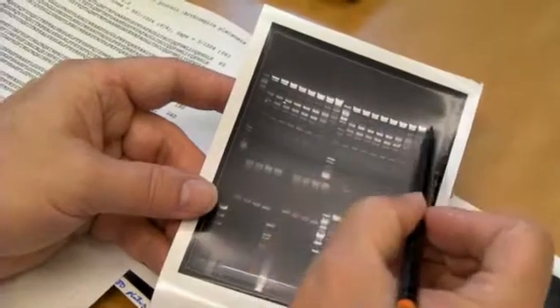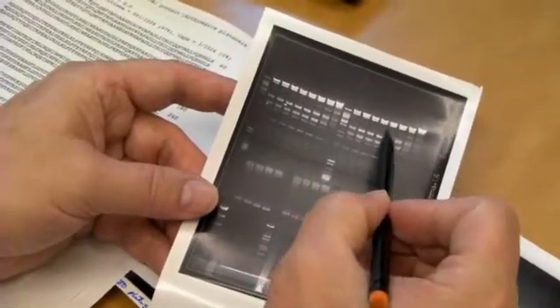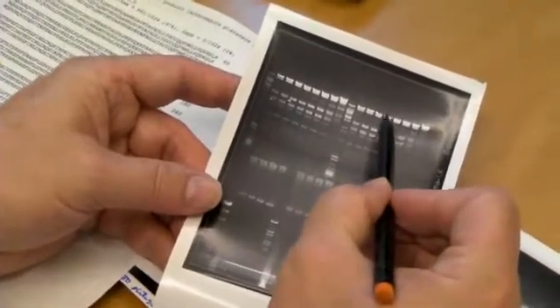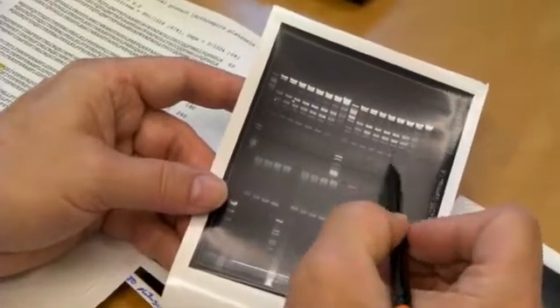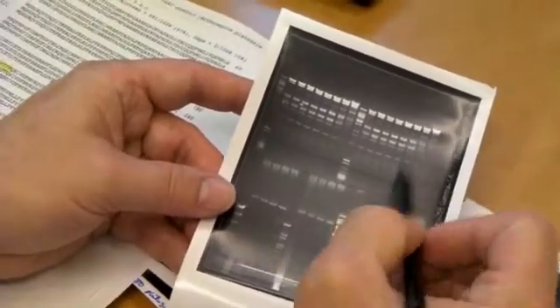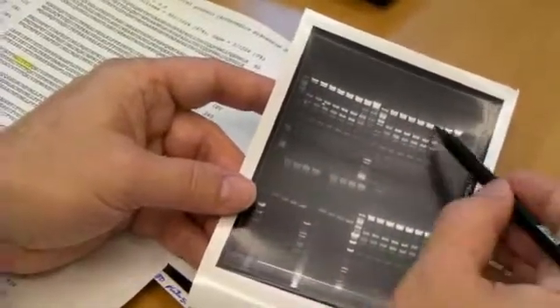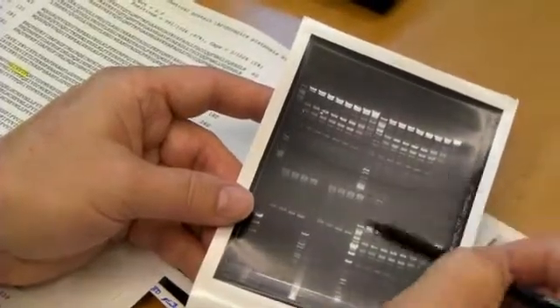This is lambda DNA, which is one big intact piece, and it's cut with different amounts of enzyme. We're looking at how much enzyme do I need to cut this at every place where this enzyme recognizes the DNA, so it would be a complete digest. So these are complete digests. These are clearly incomplete. This is the highest concentration to lowest.